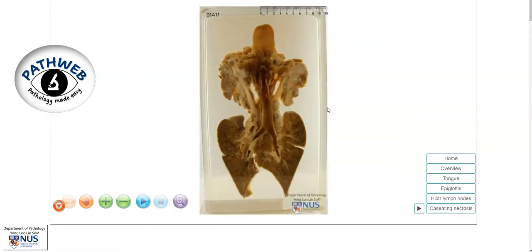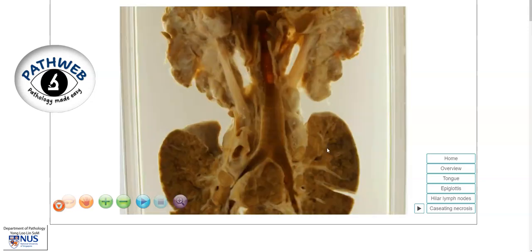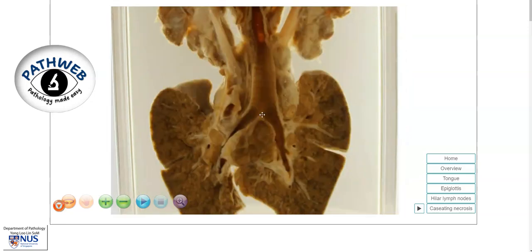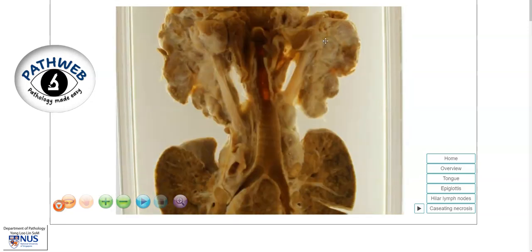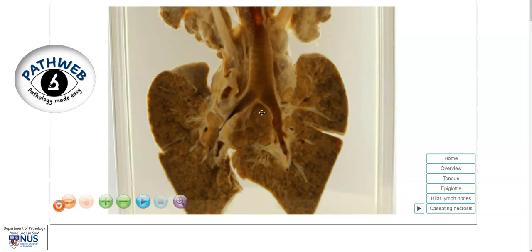So in summary, this is a specimen showing an example of TB, which is involving the lungs giving rise to consolidation. It is also involving the mediastinal lymph nodes as well as the cervical lymph nodes, causing enlarged, matted lymph nodes with areas of caseous necrosis. Thank you.